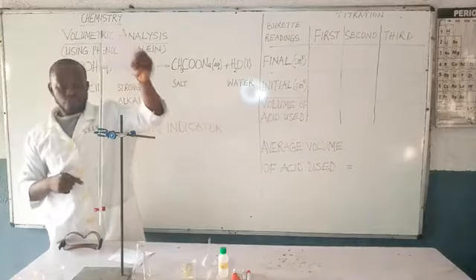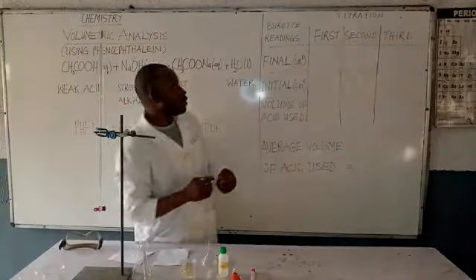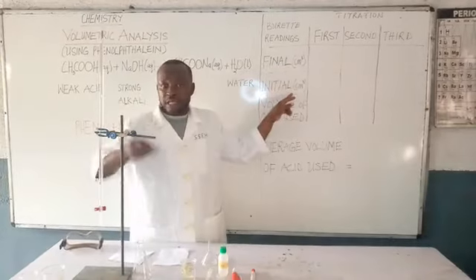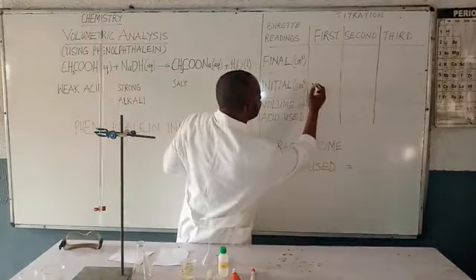Do you understand? I'm going to record that right here in the table on the board. I have final reading, initial reading. Have we started the titration? No, so the reading here is the initial reading, 0.00.